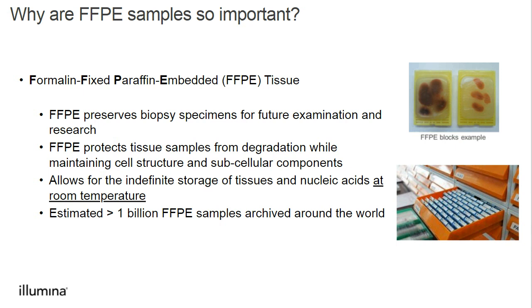It protects the tissues from degradation, and it maintains their cell structure and subcellular components. And this allows for the indefinite storage of the tissues as well as their nucleic acids at room temperature. It's currently estimated that there's greater than 1 billion FFPE samples archived around the world.